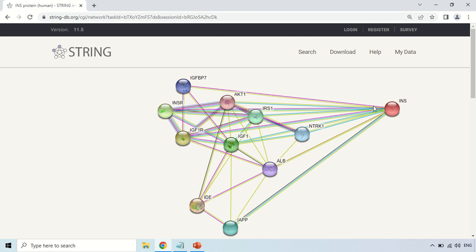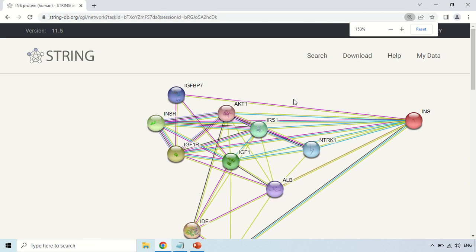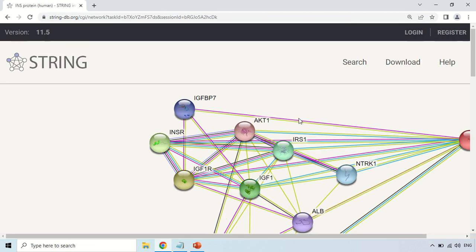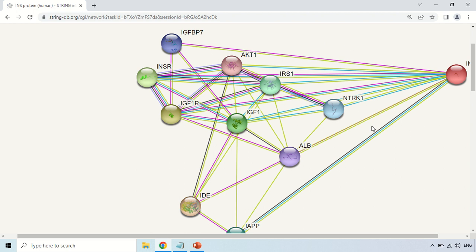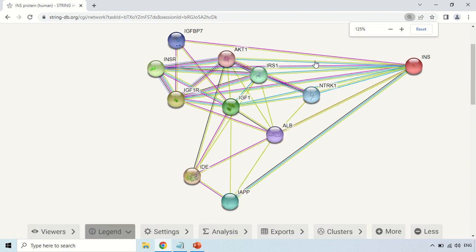Now, how to understand how much interaction exists between your protein and other proteins? The number of lines shows the interaction strength — more lines means more or stronger interactions. For example, if I zoom in, you can see that between some proteins there are only 2 lines (magenta and gold), while between others there are 3 lines. Those 3 lines represent stronger interactions, meaning insulin shows a stronger interaction with that protein because there are 3 lines, while it shows less interaction with the protein that has only 2 lines.